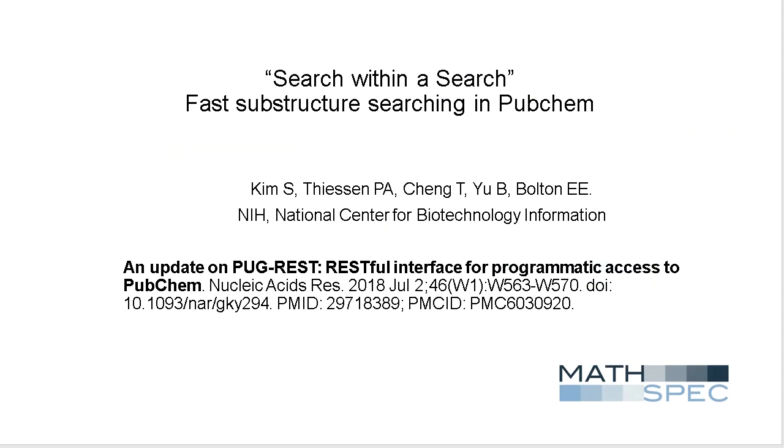It is possible to search the PubChem database for substructures. Many smaller subformulas generated using the Excel add-in correspond to only a few substructures, but these substructures are usually very common in this large database. For example, searching the entire PubChem compound database for compounds having the substructure corresponding to a methoxy group will either just stop after a million hits or time out.